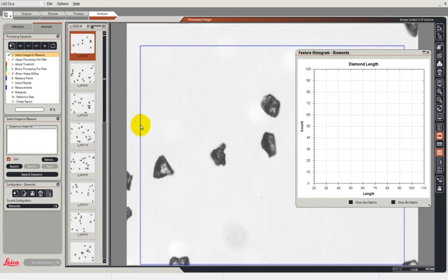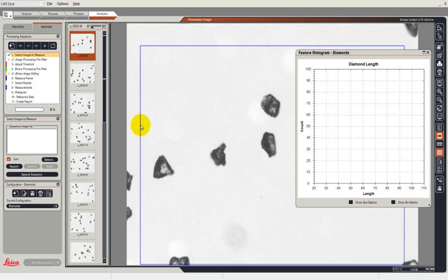In this video we're going to see how we can apply the automatic measurement sequence to a selection of images. These had been previously collected by means of an automatic motorized stage using LAS multi-step that you can see in another video.